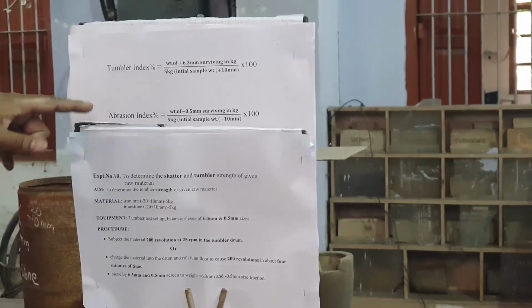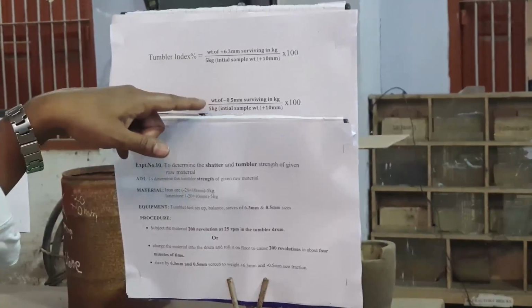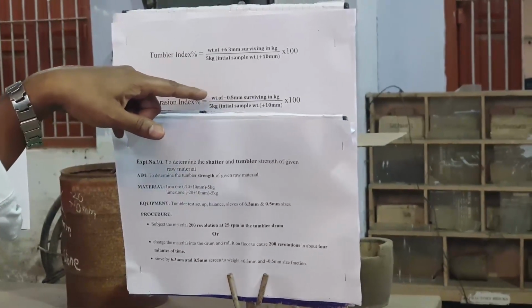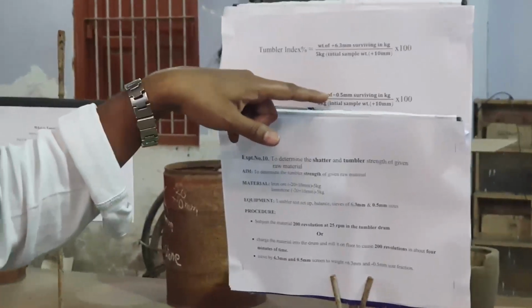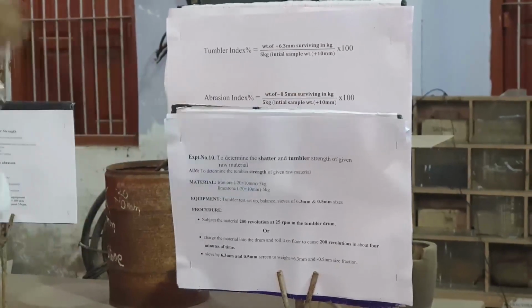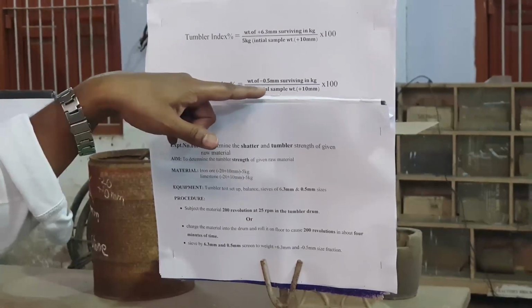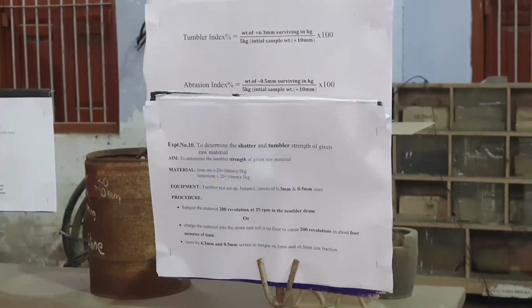One more sieve that we are taking is minus 0.5. Why is it required? Because we have to check the abrasion index. The material which is passing through the 0.5 mm sieve, that weight fraction we take to calculate the abrasion index, divided by the initial material, that 5 kg only we are taking, into 100.